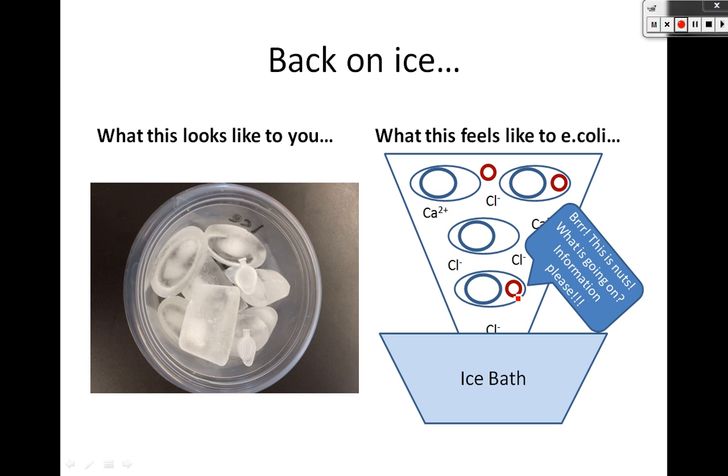And so some of that plasmid then can enter the E. coli cell. Not all of it does. You'll notice not every E. coli cell ends up transformed. When you say transformed, you mean the plasmid has gone in. Some of it does, some of it doesn't. And so that's a really important thing to keep in mind when you're making your predictions.